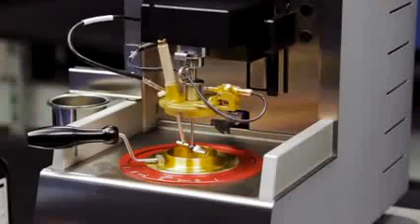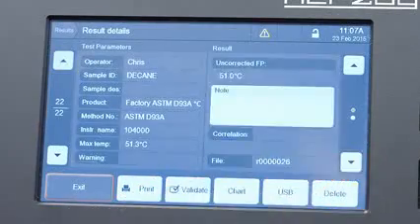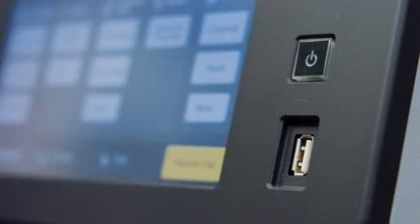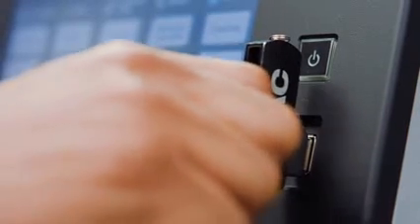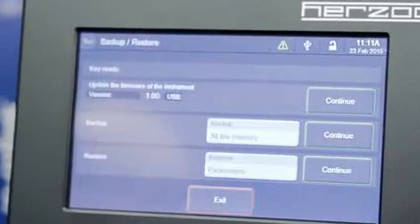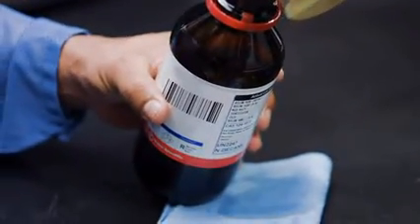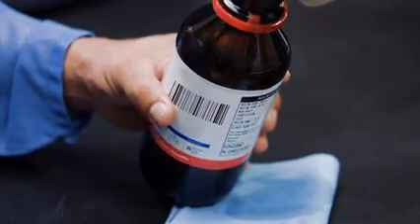OptiFlash also includes an ambient pressure sensor, which enables automatic flashpoint correction for ambient pressure. Its features, like LIMS communication and the USB drive, make it simple for users to export and share data. In addition, the barcode reader enables technicians to easily enter sample data by simply scanning the barcode on a sample bottle.